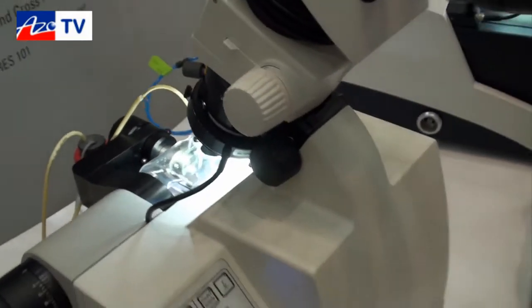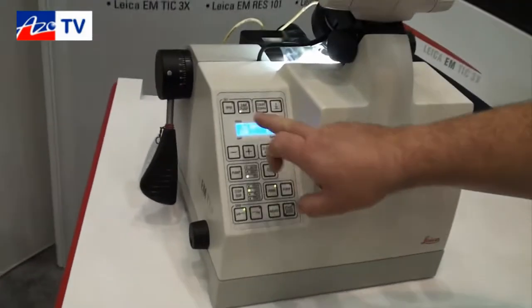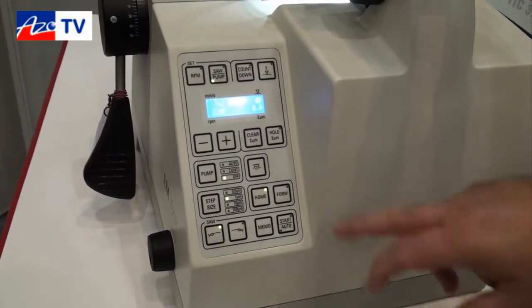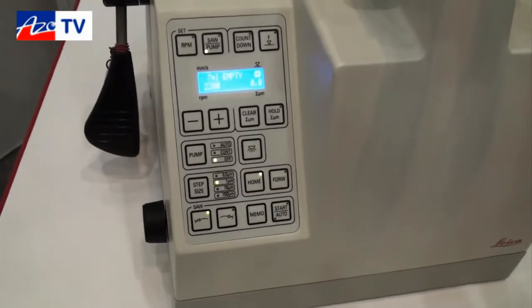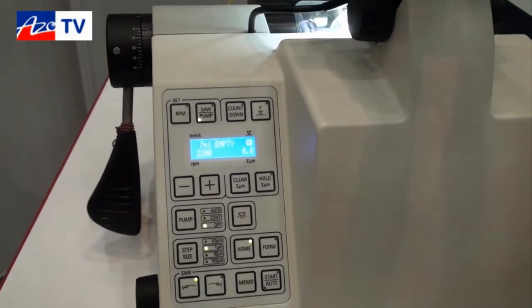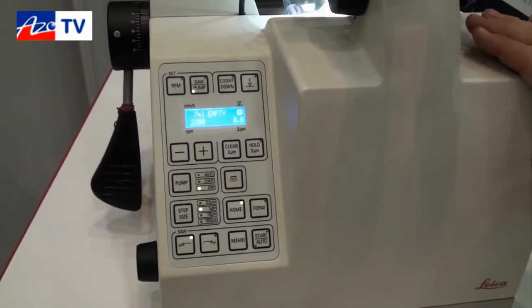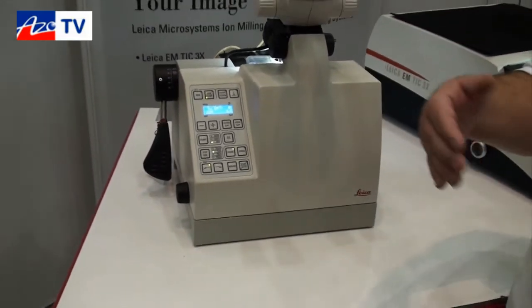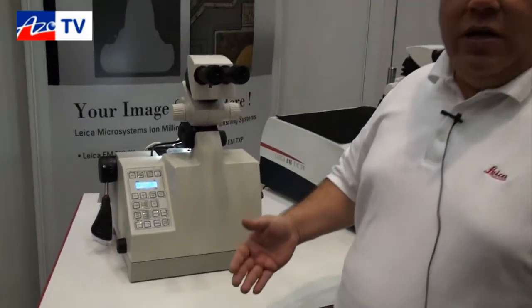It has a full operation system right here where you can set all your parameters — your RPMs, your feed speed. You can use any type of lubricant that you want if you need lubricant. This system works on a manual as well as an automated mode, so if you want to polish, let's say, a hundred microns in and have the instrument stop, it can do that as well.